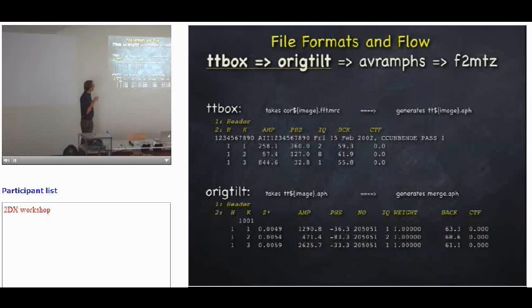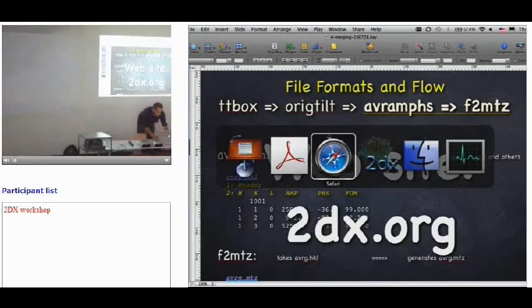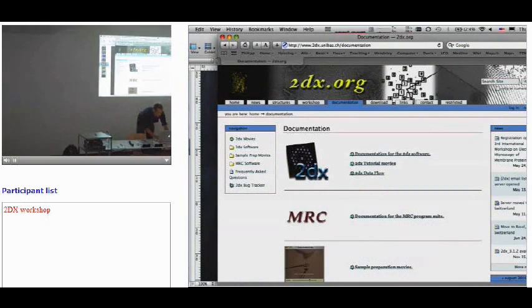And so you have to look through these file formats, and it gets pretty confusing, I find, what program calls which and in which order. So we tried to collect this information into a workflow, and we have this on this website. The website, 2dx.org, where you can download this 2dx software, has, among other things, for example, from 2006, the movie where we filmed Gyobu, how he makes the sandwich. And he annotated that and corrected our annotations.